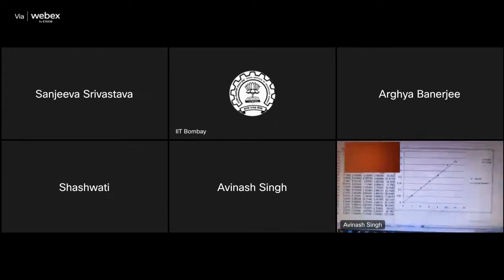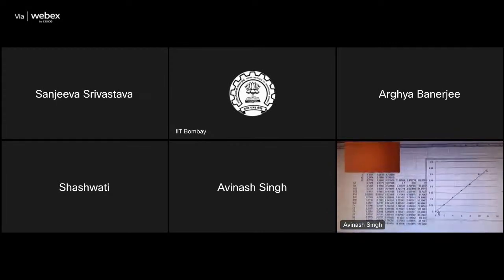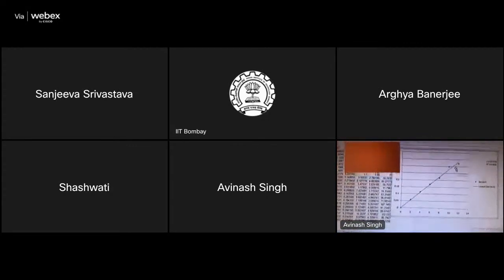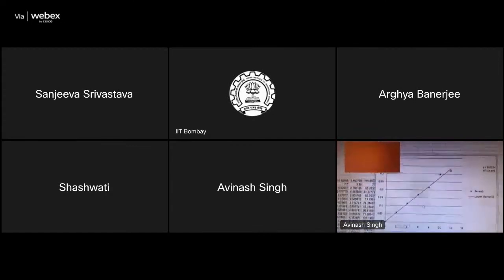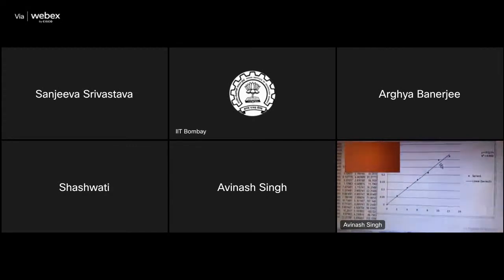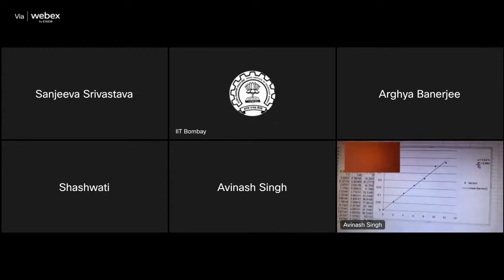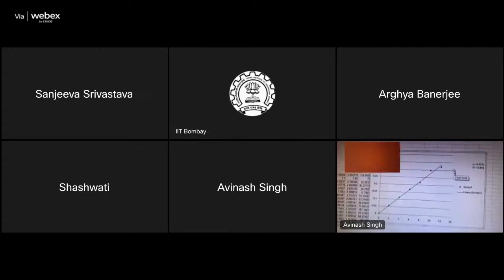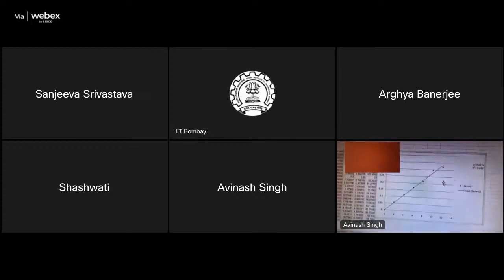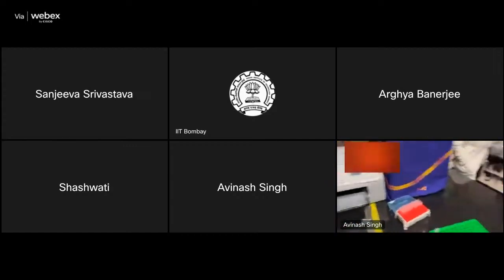After the reading is done, we can see that the graph comes up. From here we have taken the known concentrations 2, 4, 6, 8, 10, 12, 14. So we prepare a standard curve like this, where you can see that the intercept is set at 0 and the R square is coming 0.992. After this curve, with the help of this equation, we can calculate from the absorbance we get for the unknown sample what the actual concentration of the sample is, and after we get the actual concentration, we can go for further processing and digestion with the technique.